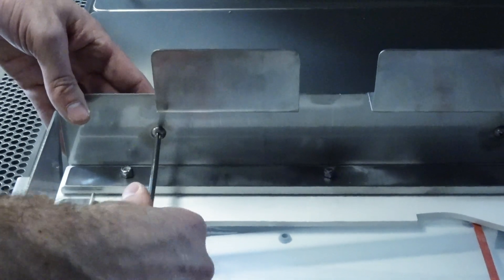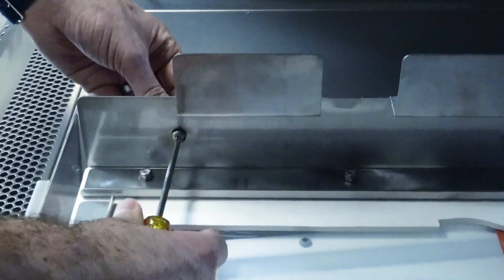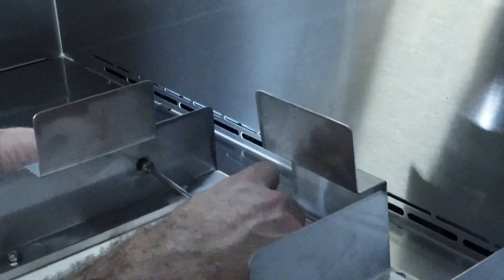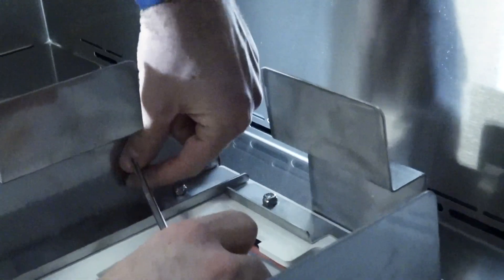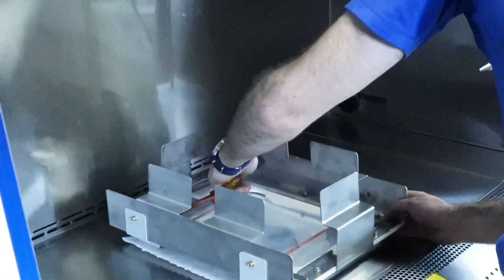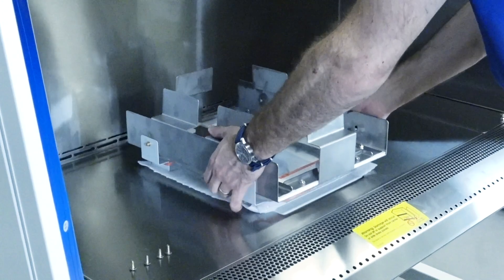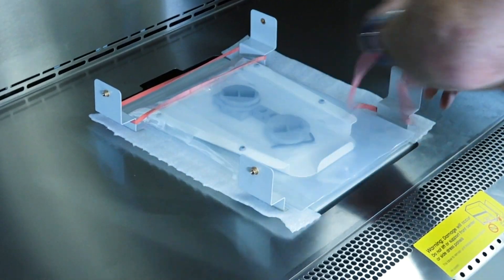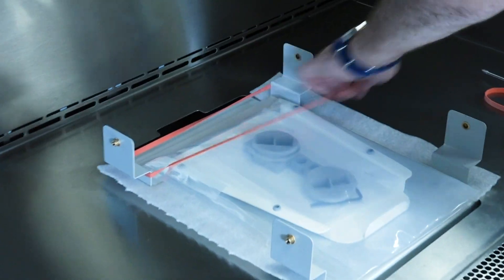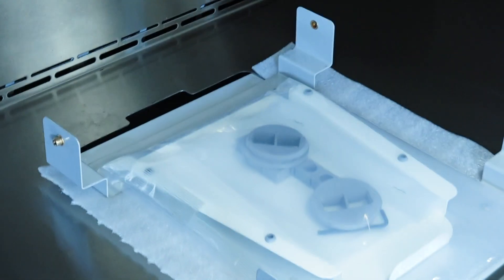Next, remove the four shipping screws from the scope seal assembly. Set aside the plastic bag containing the microscope mount and pass-through components. We'll use them soon.